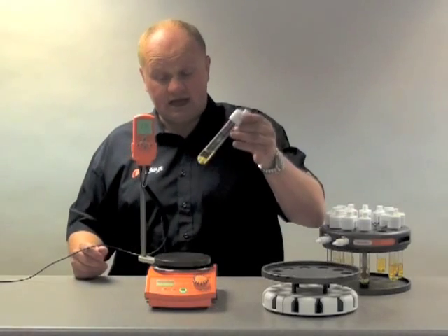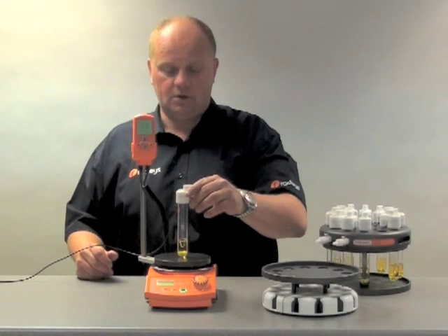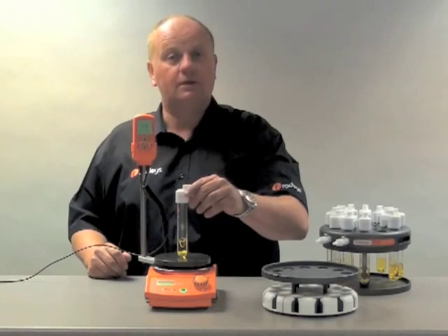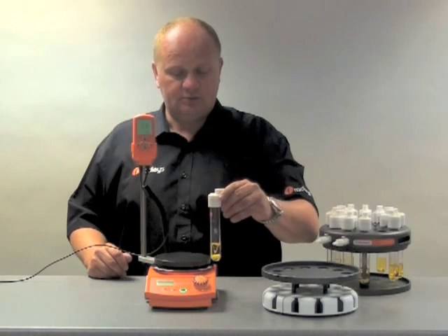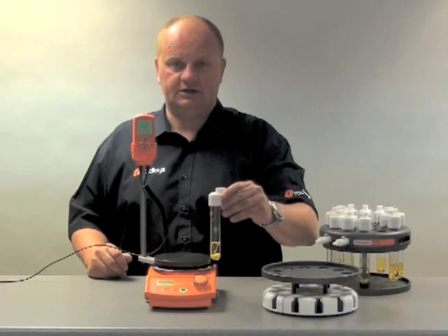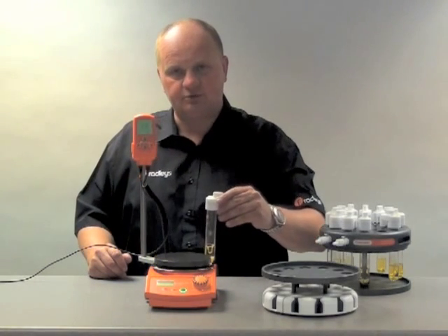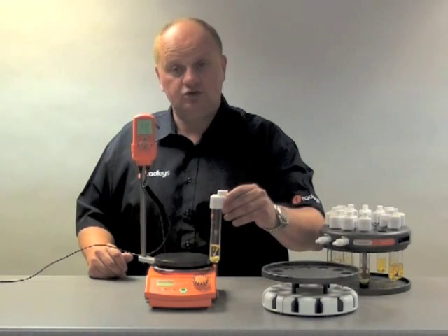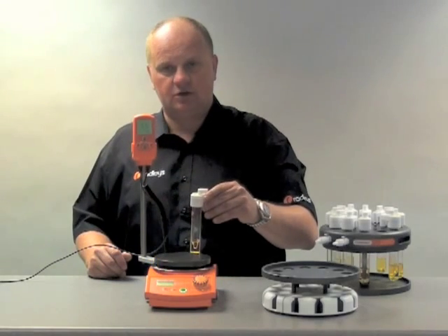Traditionally, a scientist would use a stirring bar and a tube like that — optimum position for stirring. However, what the chemist at GSK discovered was that not here but here also gave you excellent stirring. So we have even stirring all the way around this periphery. That is part of the Carousel's unique patent. Also, we have even heating because we're equidistant from the centre of the block.